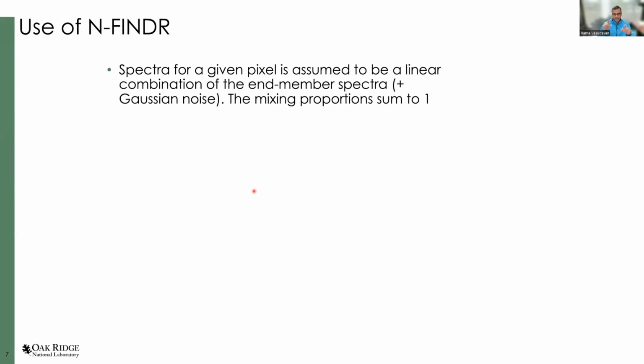So if I can choose 3 or 4 or n different Fourier transformed image windows, I want to choose such n members that I can reconstruct any number of constituent windows within our data set. And it has to obey certain constraints.